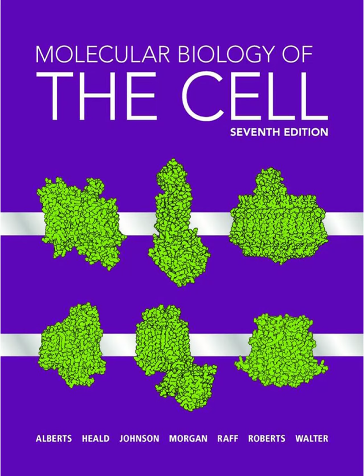Okay, so if light's a wave, how does that actually cause blurring? Is it like overlapping waves canceling each other out? That's pretty much it. It's called diffraction and interference. When light waves from a point source pass through the lens, they spread out and interfere with each other. This makes what should be a perfect point appear as a blurred disk, often with faint rings around it. That's the Airy disk, or the point spread function. And when the blurry disks from two nearby points overlap too much, your eye or the detector can't tell them apart anymore. They merge into one blob.